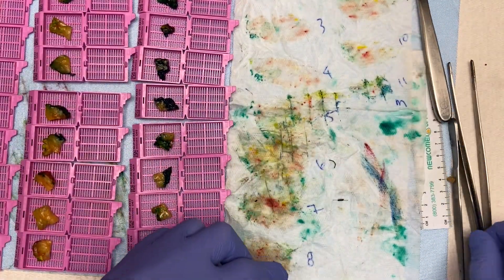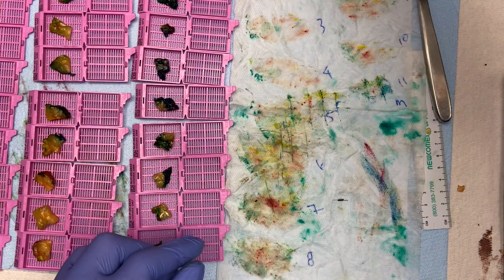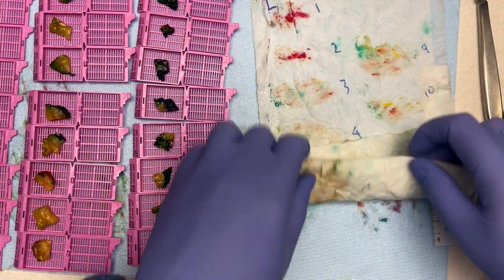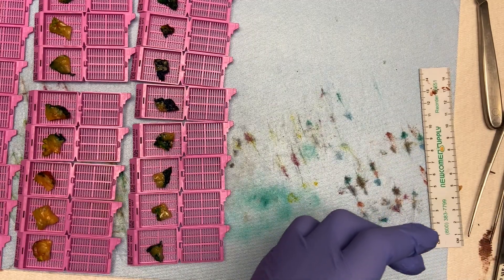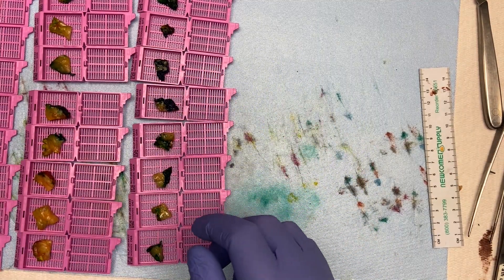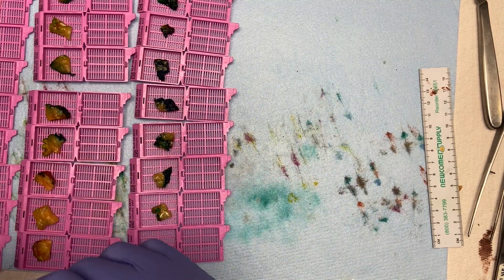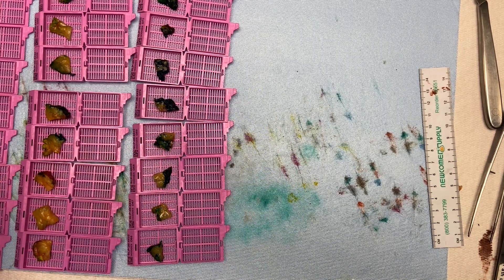We ended up with 75 cassettes. Now, this is an academic institution — doing this many cassettes on a partial mastectomy is substantial. In a private practice setting you'd probably do around 15 blocks and get basically the same results. But this is how we do it here, and I'm mainly demonstrating the process. I'll do the dictation now.